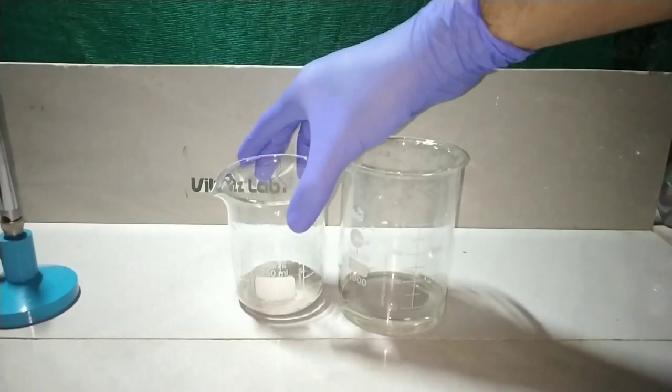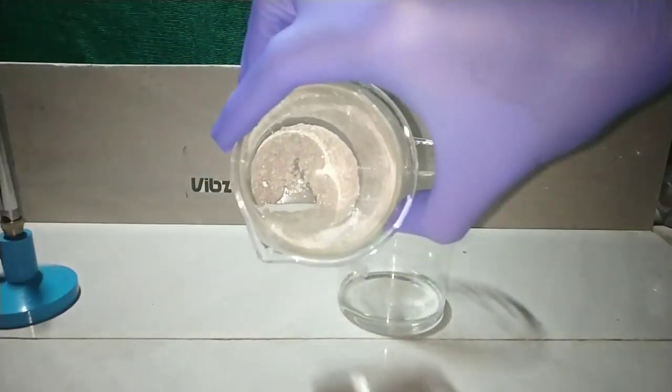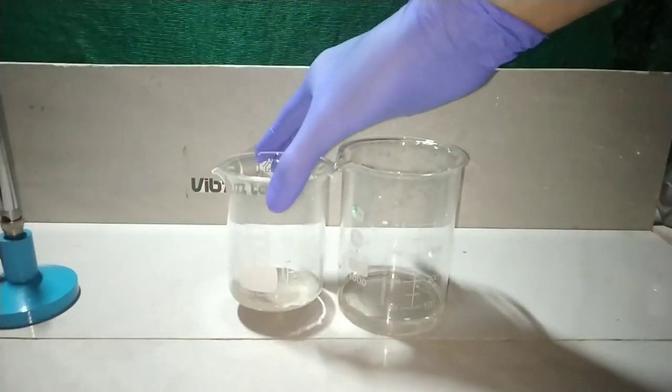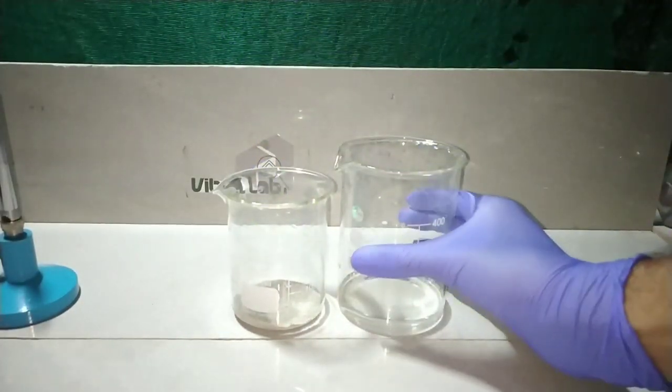And now you can see the metal is almost pure now. So into that I am adding about 40 ml of 68% nitric acid.